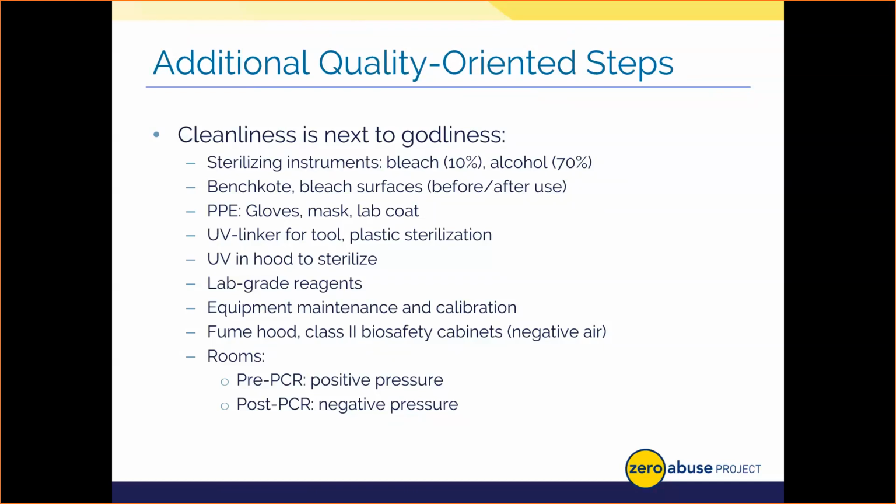Specifically, pre-PCR work like item exams, serology, and extraction should be done in an area with slightly positive pressure, where air is forced or pushed outwards. What that does is prevent the contaminated air that could have aerosolized DNA from drifting into the room and contaminating evidence. Know that other lab rooms and some equipment have negative pressure by contrast.